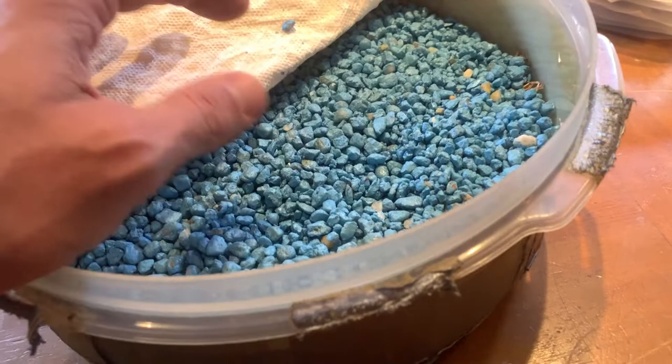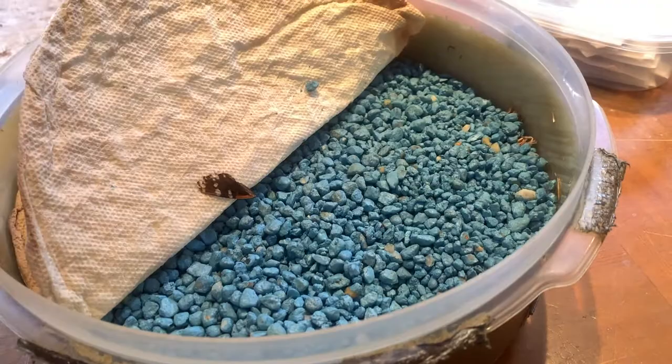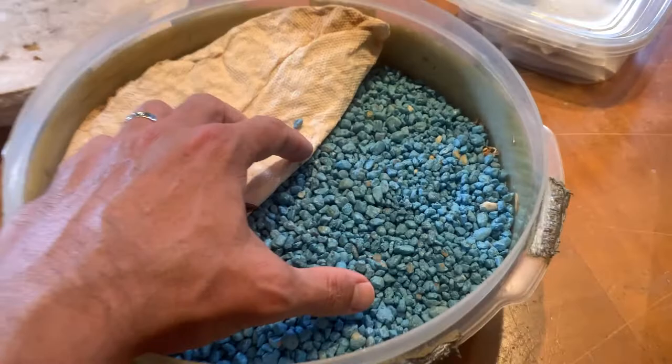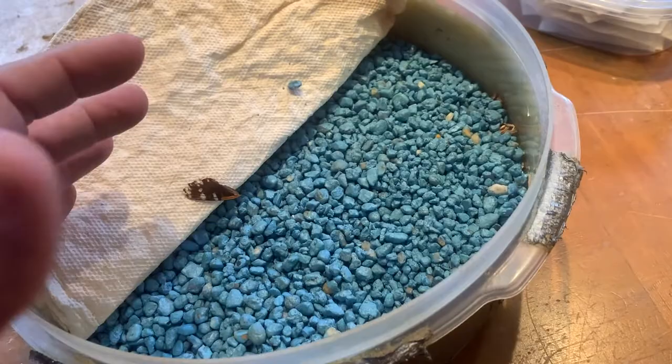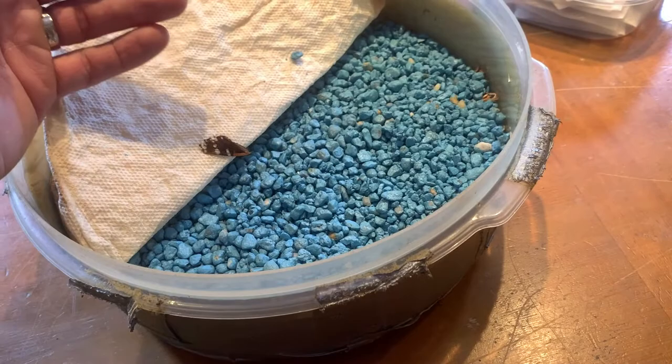I also like to sprinkle some chlorocresol crystals in here. Chlorocresol is a fungus inhibitor and it'll keep mold from growing. So if you forget your specimens in here for a couple of days and think, 'Oh man, I forgot I put specimens in my rehydration chamber,' you're not going to come and find white fuzzy stuff on your specimens ruined. I'll put my gravel down, I'll put my chlorocresol crystals in — not a whole lot, like a quarter of a tablespoon of chlorocresol crystals will last you for a long time.